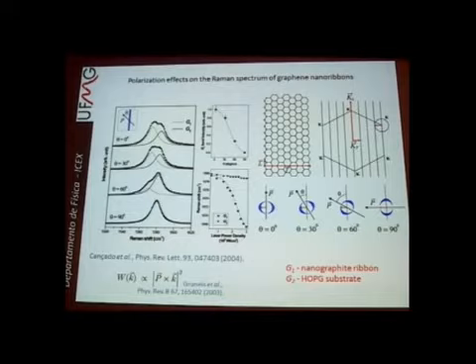And we did Raman spectroscopy of these nanoribbons, and we find this is graphene on graphite. Okay, so you have the nanoribbon, and the substrate is graphite, and we have two G peaks basically. We show that the G peak for the ribbon is strong if the light is polarized along the ribbon. Okay, so this is the G peak from the nanoribbon. If you rotate the light, the G peak goes down. This was a joint project with Enoki Sensei's group.